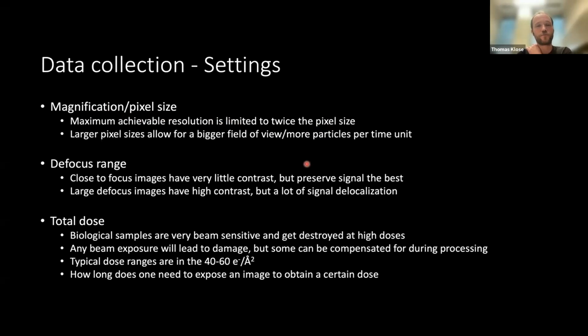to be 1 angstrom, or actually smaller than that, because almost nobody has ever achieved the maximum theoretically possible resolution, because the signal to noise ratio is just not very good when you get very close to the maximum.